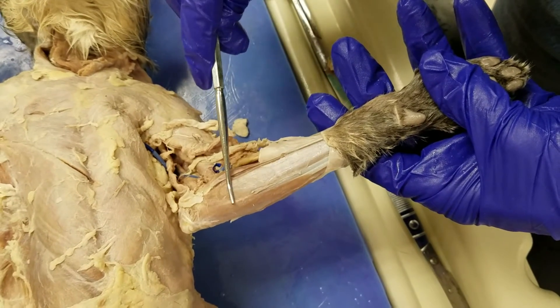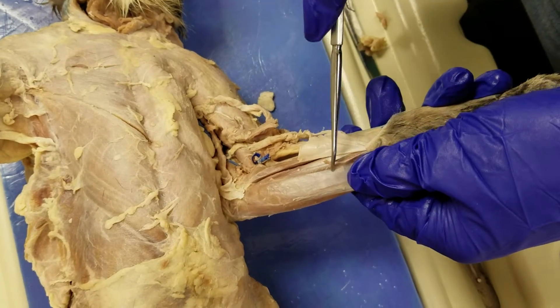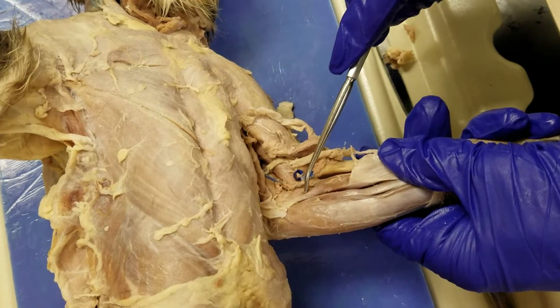Palmaris longus, flexor carpi ulnaris, flexor carpi radialis, and pronator teres.